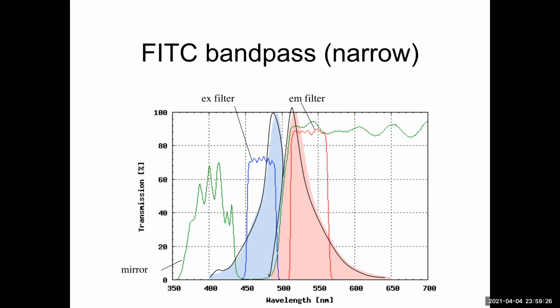You can see in this case with FITC, the filter set that we're choosing, look at the blue line for the filter sets. It's almost 80%, maybe 70% transmission. But the important thing here is the colors. The colors are 450 to 500. That is barely catching the peak, which is 495, I think, if I'm recalling correctly.